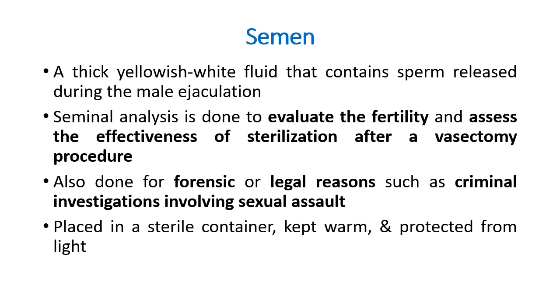Bakit nagpapatest ng seminal analysis sa mga lalaki? To evaluate the fertility, assess the effectiveness of sterilization after vasectomy procedure. Ginagawa din to for forensic or legal reasons such as sexual assault, yung mga rape, ganun. Tapos, it is placed in a sterile container. Dapat ito ay kept warm, protected from light.